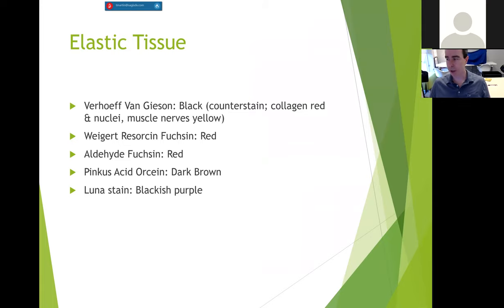Elastin tissue, this is very Dermpath apropos. Most labs use a Verhoeff-Van Gieson, and we often use elastin stain to determine if we're looking at a scar, because a scar has decreased or no elastin versus normal dermis, where you'll have the elastin network. There's all sorts of elastin-containing tumors. There's congenital elastin deficiencies, et cetera, that we can use an elastin tissue to stain for.